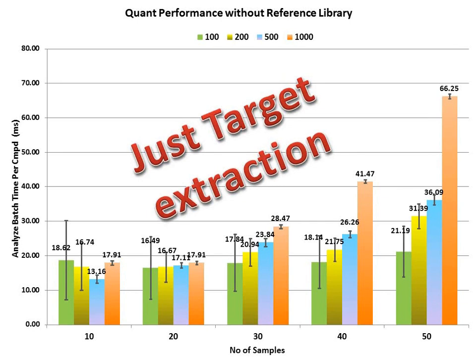While you are absorbing this graph, let me record that these experiments range with target compounds from 100 to 1000. And the data is acquired from a 20-minute LC-TOF run. It's performed on a shipping Z400 with a shipping 8 gigabytes of memory. Yes, more memory can make a difference. So let's look at the graph.